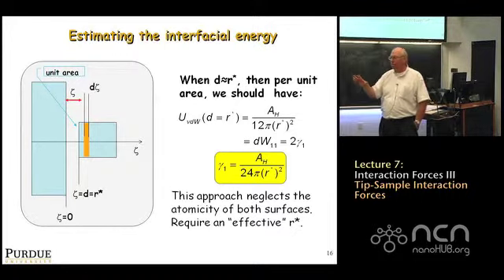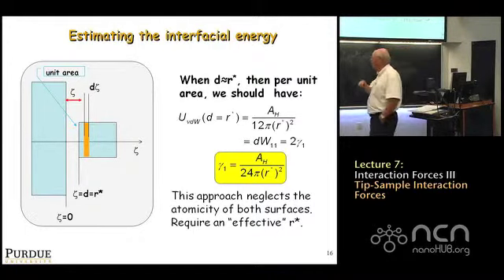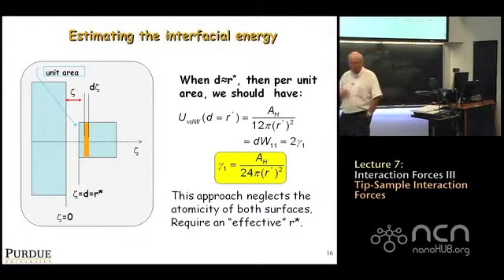So this is one way to get at that parameter A sub h, which is really elusive. People always talk about it, but the issue is, how do you measure it? How well do you know it? Because if you don't know that, then it's hard to do a first principles calculation of how a tip interacts with a substrate. This is one way experimentally you can get at it. So that's the point of this little diversion.